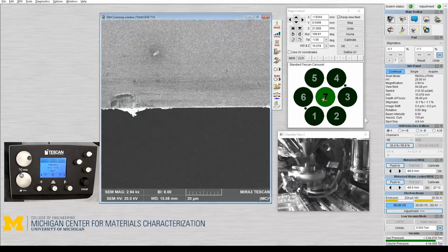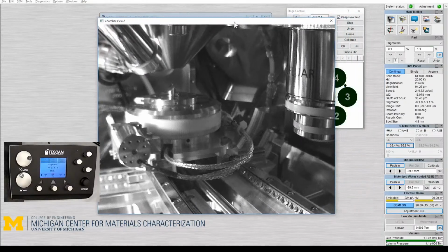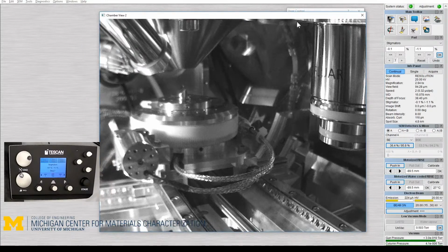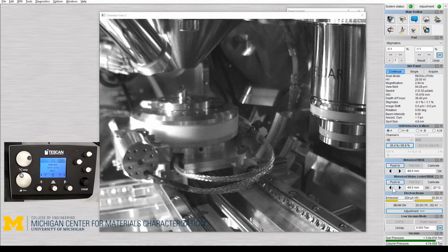Okay, so this time we've hopefully learned our lesson, and inserting the mirror, I'm going to do that with the beam off. So that will protect the beam from any gas burst that may turn the FEG module off. So now I have the CCD image up on screen. I'm going to insert the mirror, and you'll see it enter from the left side of the screen.